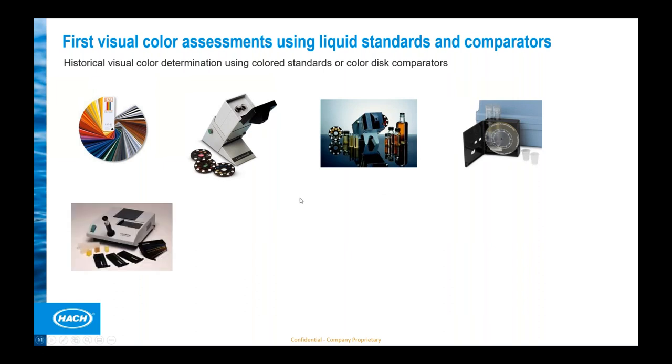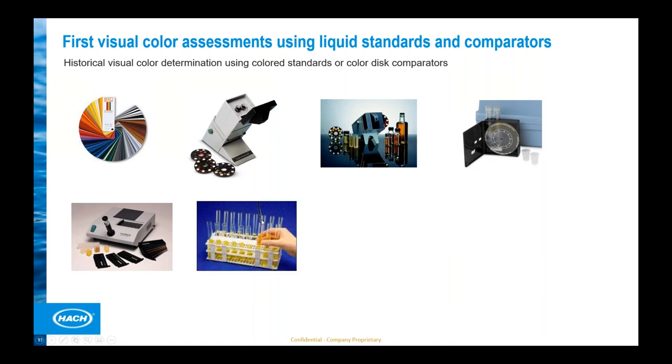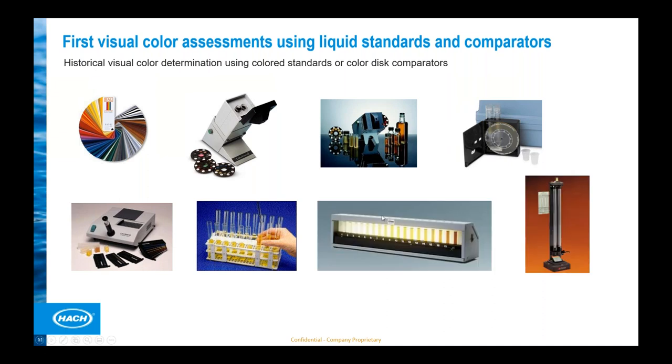We see simple measurement systems, machines that are based on a comparison of a color wheel, a defined color here visible, and the color of the liquid, which is subject of a check to get information about the intensity and in principle also the color of the measurement. So we see much more of this equipment here on the right side. We will also hear more about these different color scales. Some are based on dilution factors, giving a different color intensity. All these will be subject later on.